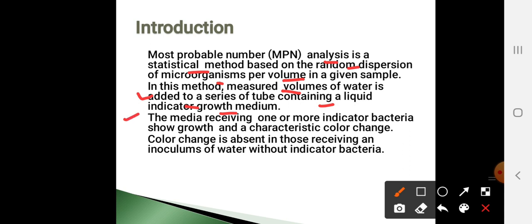The media receiving one or more indicator bacteria show growth and a characteristic color change. Growth of the bacteria will indicate the color change in that specific medium.